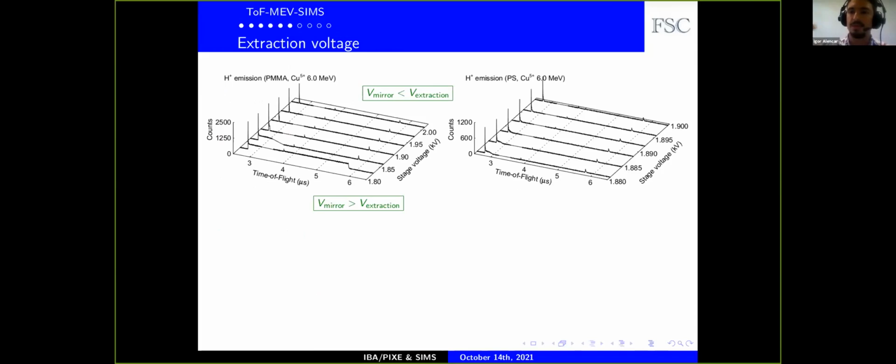as the extraction pulse rises, we will observe a plateau. So we have first a peak, which is the same principle and idea of the delayed extraction. That's why I talked about this, because these gaseous molecules and ions, secondary ions, that are on top of the sample can be accelerated into our detector. So we have an integration of this moving gas. Then we have a plateau.